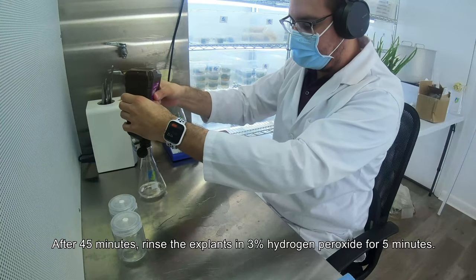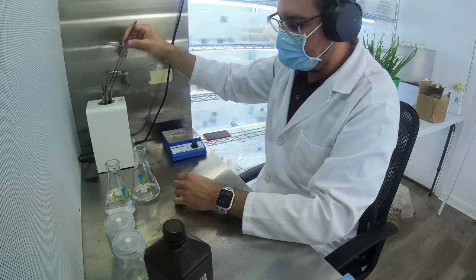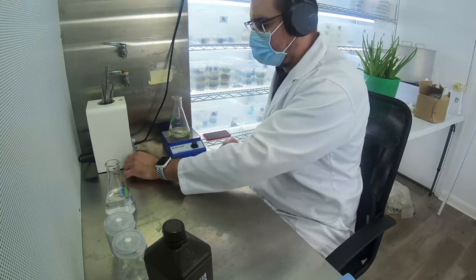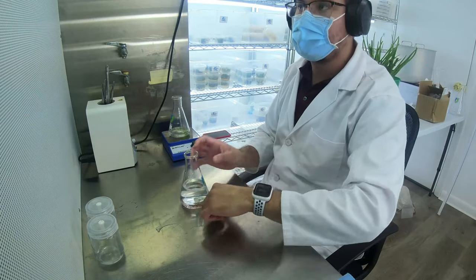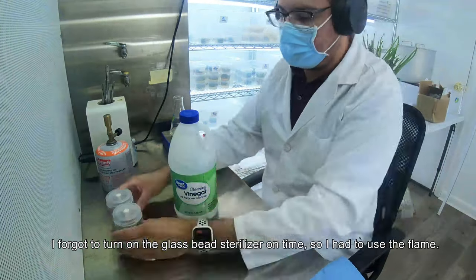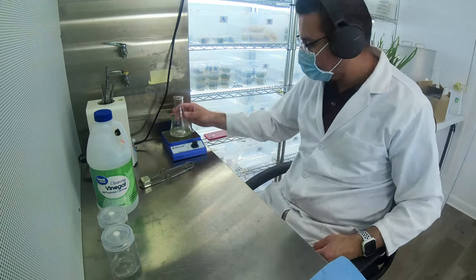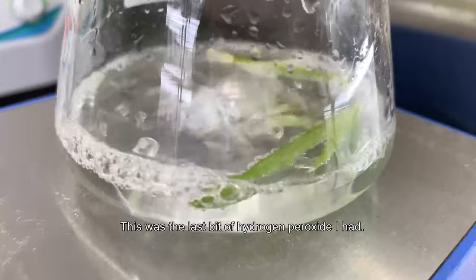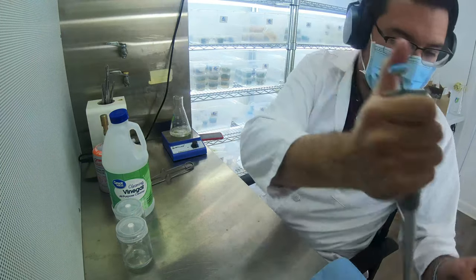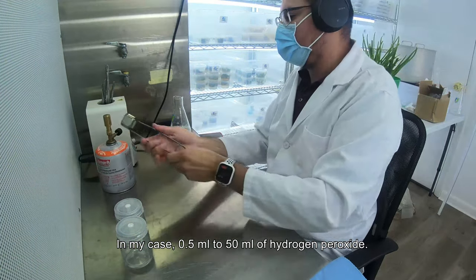After 45 minutes, rinse the explants in 3% hydrogen peroxide for 5 minutes. I forgot to turn on the glass bead sterilizer on time, so I had to use the flame. This was the last of the hydrogen peroxide I had — I need to get more before I sterilize more plants. With one minute left, add 1% volume of cleaning vinegar — in my case, 0.5 milliliters to 50 milliliters of hydrogen peroxide.